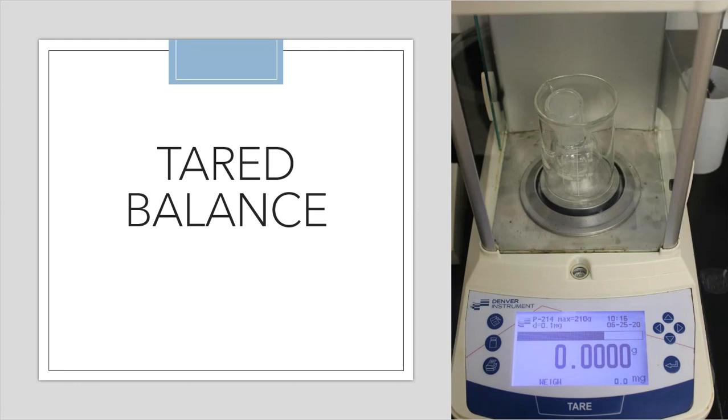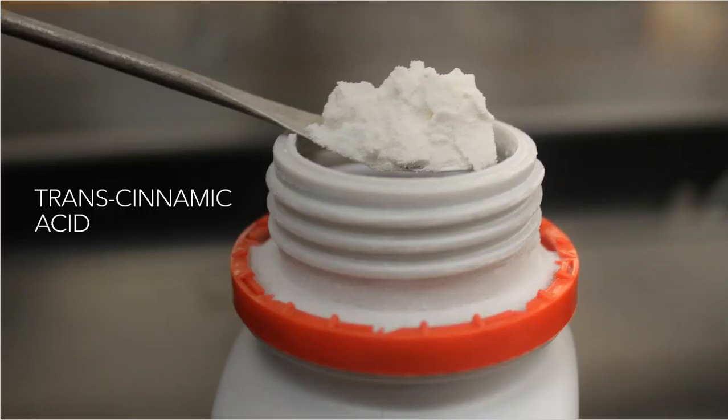So my directions tell me 10 millimoles. I know how much that is as far as gram goes, and I need to be somewhere in that ballpark. All right, so I go to my trans-cinnamic acid. This is what it looks like, so you can make those observations as you see fit in your lab notebook. But that's what raw trans-cinnamic acid looks like. A lot of people say, does it smell like cinnamon? And the answer is no, it doesn't really smell like cinnamon. It is a cinnamon relative. And there is a slight, what I would call warm, nutty odor that comes from trans-cinnamic acid. But it's not really a cinnamon type of smell. It's smelling a little bit like holidays sometimes, but nothing like cinnamon, right?